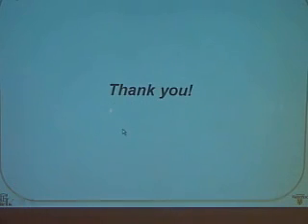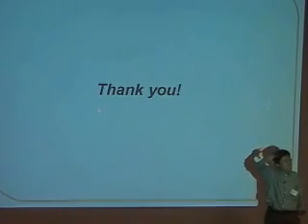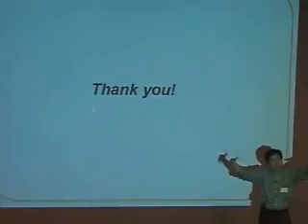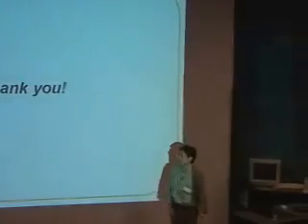Thank you very much. Anyhow, what I was going to show you is that you'll see the fiber start from a few seeds and a few nuclei. They're going to grow this fiber network. That imitates, to some extent, the amyloid beta, which is the disease state. You want to eliminate that. Thank you very much.